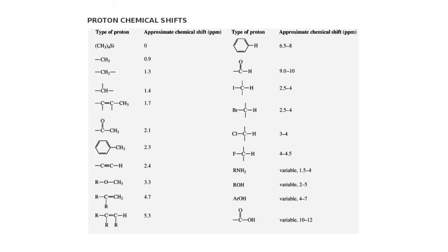You will be able to use and print out the proton chemical shifts table. Similar to the IR frequency table that I provided to you a couple weeks ago, this will help you figure out where the protons can be found on an NMR spectrum. Unlike the bonds that we focused on for IR, this is going to be focusing on hydrogens. In each example, we have hydrogen, hydrogen, hydrogen. Anytime you see an H, this is what these numbers are representing. So you can actually just go through and underline all of them.